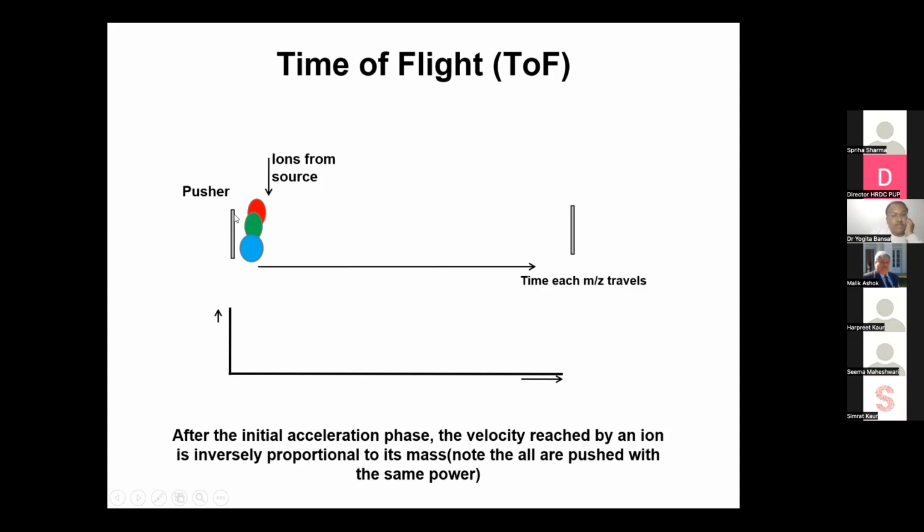When it pushes the ions, we are giving an equal, uniform energy to all the ions, and all the ions have different masses. So the kinetic energy of every mass will be the same.